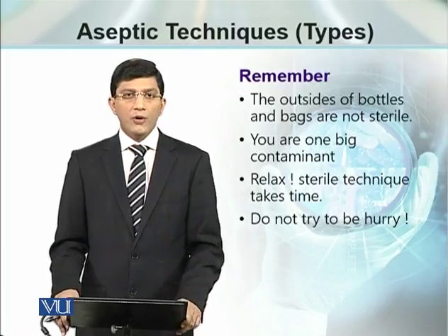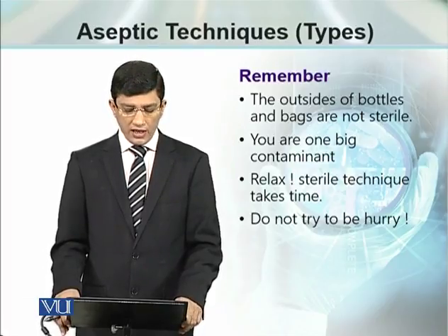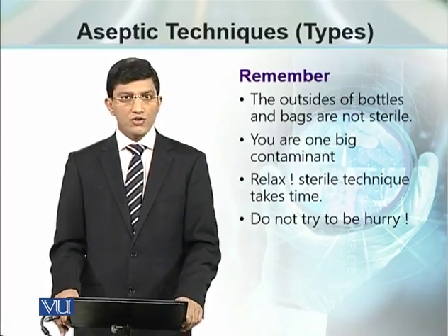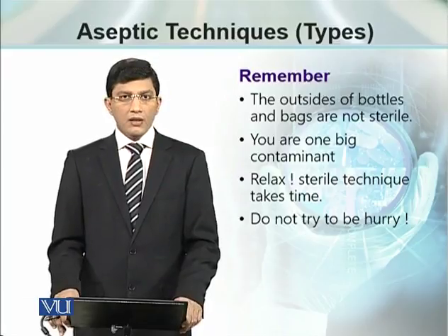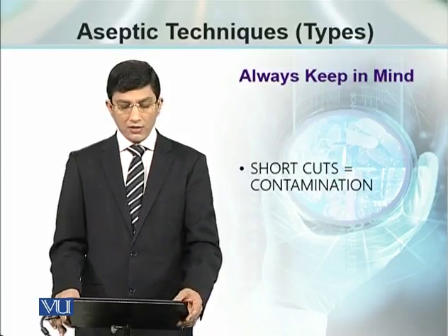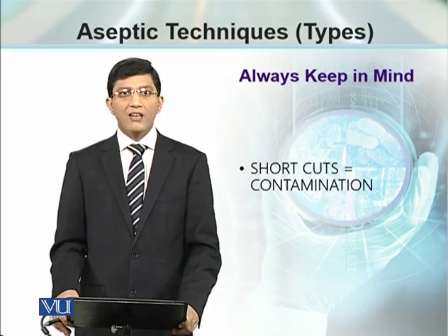Keep in mind, the outside of the bottle, the outside of the bags are not sterilized. You yourself are a big source of contamination, so be prepared to avoid contamination. Relax. These methods are time-taking. Shortcut means contamination. So avoid shortcuts while working in the lab.